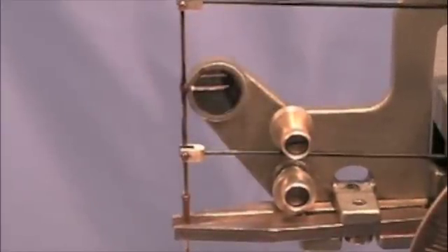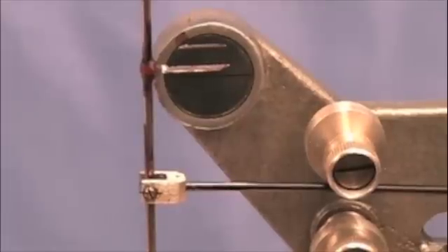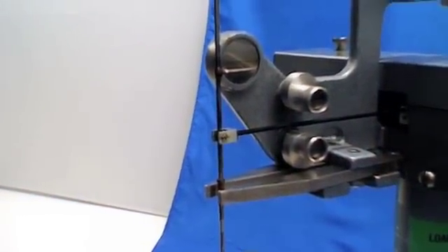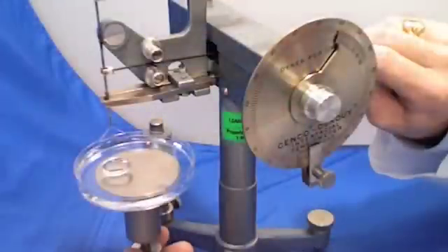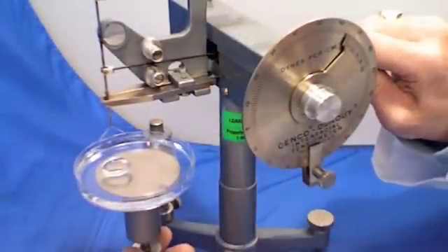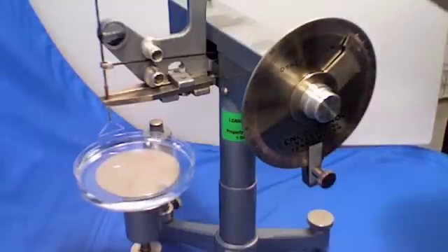Using a method of first lowering the sample stage with the left hand, and then using a countering adjustment with the right hand to maintain the ring alignment with the mirror indicator line, is important to calculating a final result. This process will bring the ring up through the liquid surface, and is repeated until the Denoy ring pops through the liquid surface.